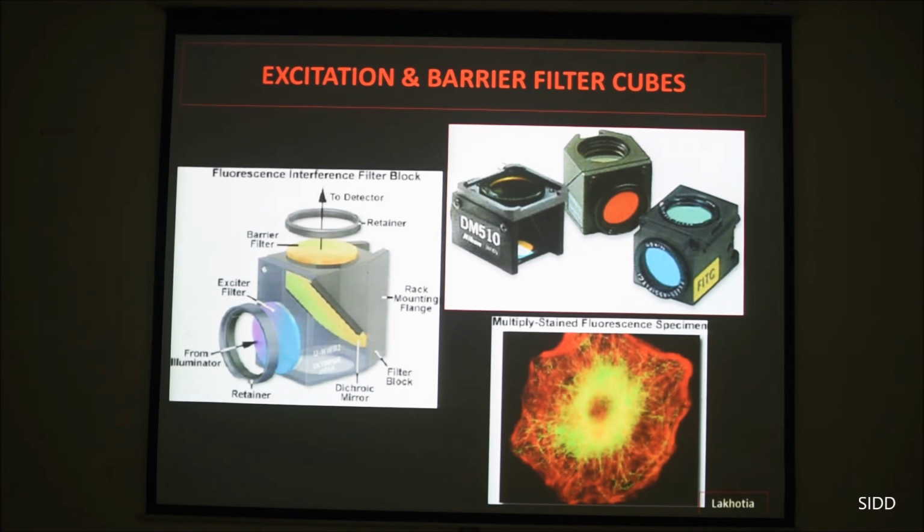The object generates fluorescence because of this particular wavelength, which has certain molecules that will give fluorescence, and that fluorescent light will now travel up by internal reflection. This is what I am showing in a typical upright fluorescence microscope. A similar thing will happen in an inverted microscope.